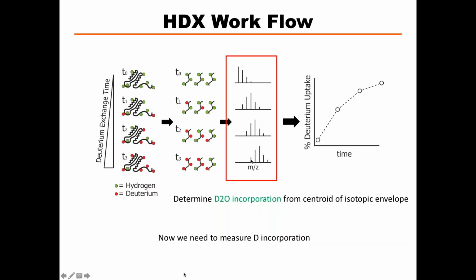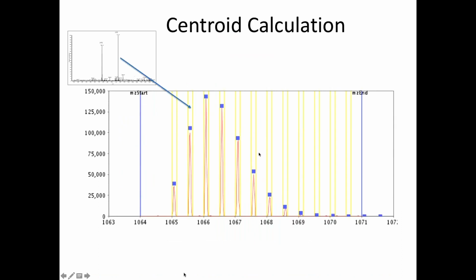So there's a part in here that I didn't really talk about. Not the instrument, but what it actually looks like. So remember our doubly charged peptide spectrum. What I didn't show you is when you blow that up, you see that you have isotopic resolution on these high resolution mass spectrometers. What this means is that here's your monoisotopic mass for this peptide. So this is your carbon 12, nitrogen, hydrogen, oxygen, sulfur, etc. But there's a percent carbon 13, depending on the number of carbons, and then you get this peak here plus the other isotopes.